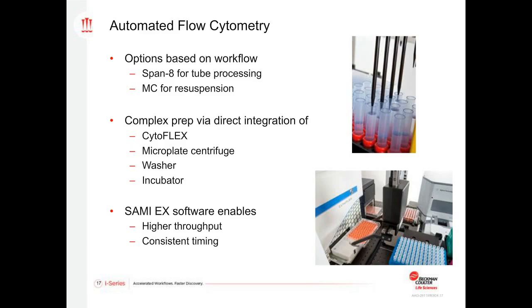We also, kind of on the right-hand side of that image, you can see a microplate centrifuge that can be directly integrated onto the deck. And again, this is excellent for the spin down and wash steps for those antibody type protocols. We also have the option to integrate a plate washer if this would help assist things. However, the multi-channel can essentially do most of this workflow by itself with the addition and removal of washes, etc. And there's also the ability to integrate incubators, either something small shown as the single plate incubator next to the CytoFLEX in the image, or much larger, higher capacity incubators such as the Cytomat 2C.